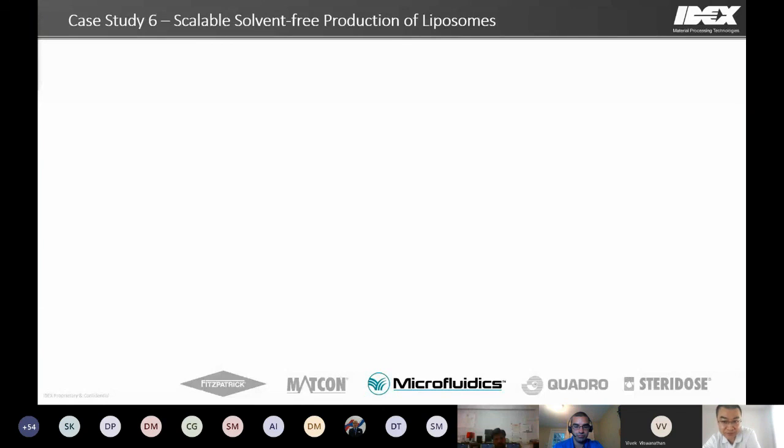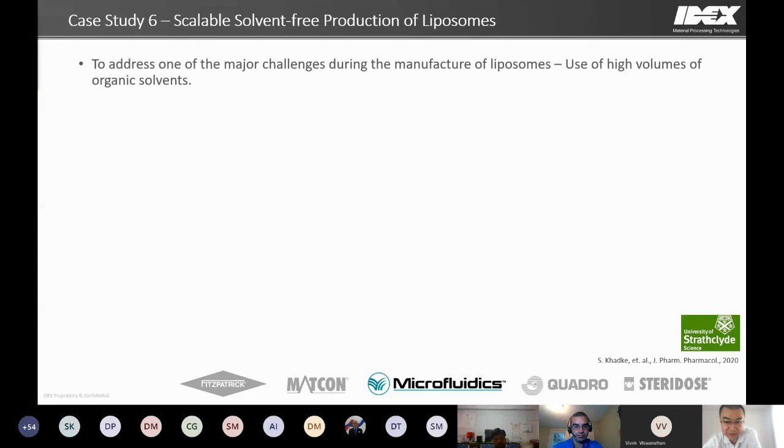it's a very important issue across all liposome preparation techniques, which is the use of organic solvents, because so far solvent has to be used either sooner or later in the process, regardless of which method you're using to create liposomes. For example, if you use the thin film method, we have discussed extensively. So you have to use the solvent to dissolve all the lipids to form the film. Even though the solvent will be removed before subsequent liposome preparation or downsizing, it's still used there.